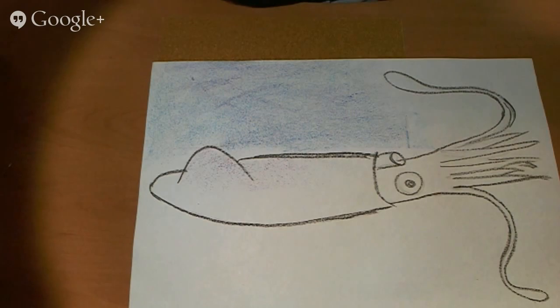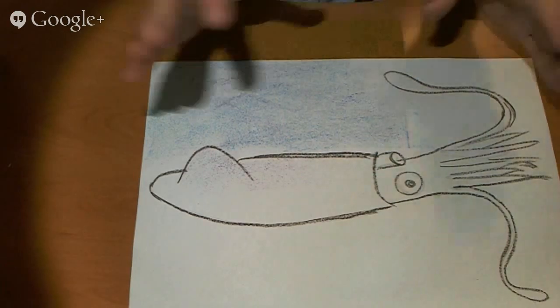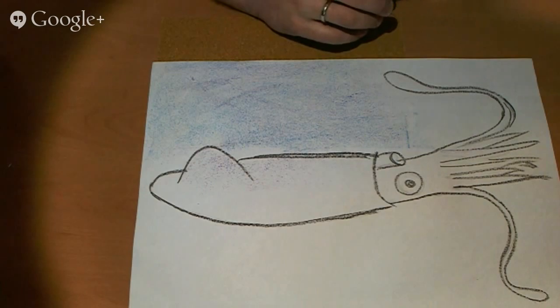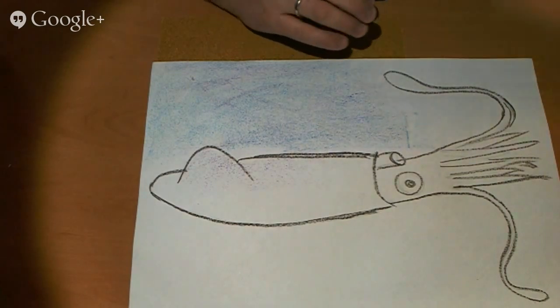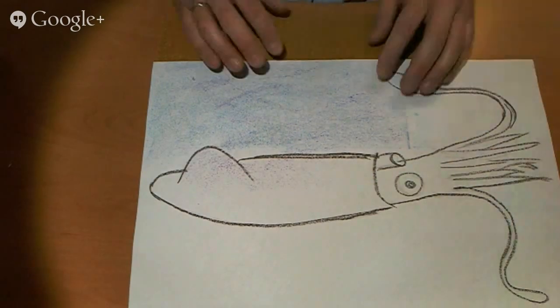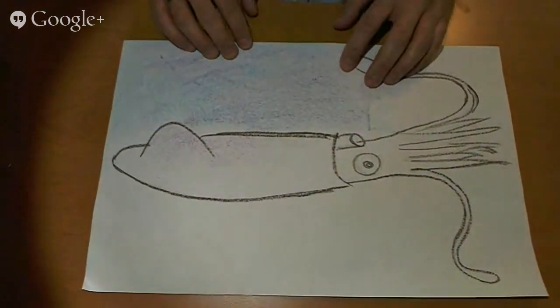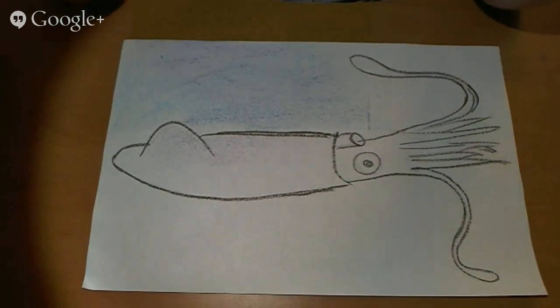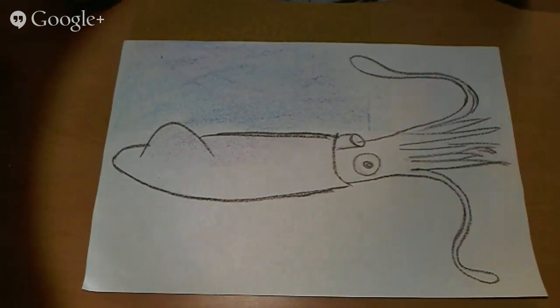And I see some kids are getting grossed out, and that happens. This ends up being a really good alternative for kids who don't like to do squid dissection. They can go to a video like this. It doesn't have to be mine, obviously. It could be anybody's. Go to a video that shows dissections so they can at least get an experience of it. I still believe in dissections, though.